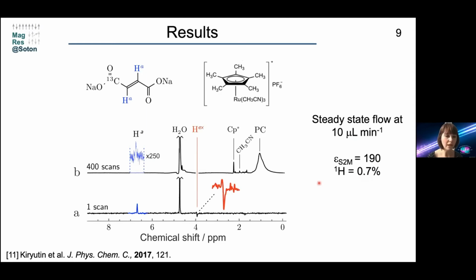If we examine the hyperpolarized spectrum further, we can see this peculiar feature of a partially negative line, which tells us that something else is going on in the reaction. It is known that hydrogen molecules and heavy metal catalysts form intermediate hydride species, where the two hydrogens take non-equivalent positions.